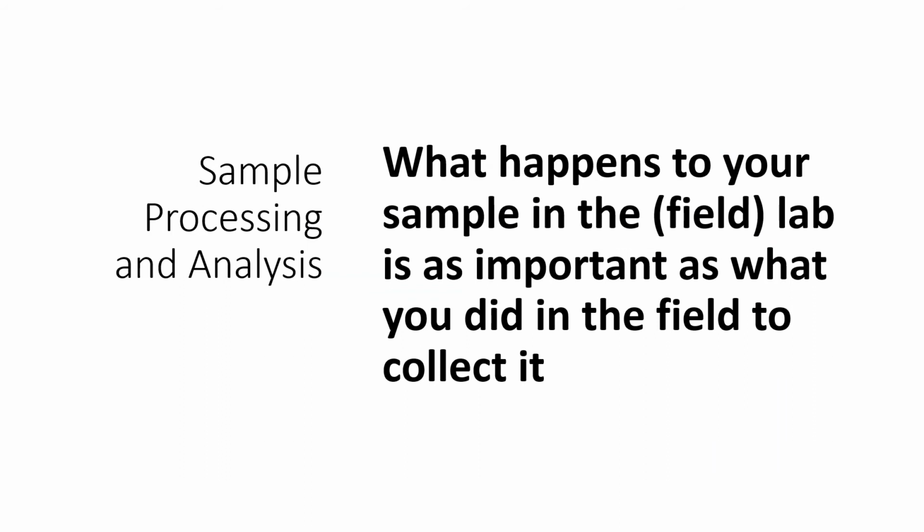Perhaps an underappreciated part of doing field sampling and analysis is the sample processing that can help to improve the reliability of the analysis of that sample. We should always remember that what happens to your sample in the field or in the field lab is as important as what you did in the field to collect it. If you have used very rigorous means to collect a sample, your sample processing should be equally as rigorous.